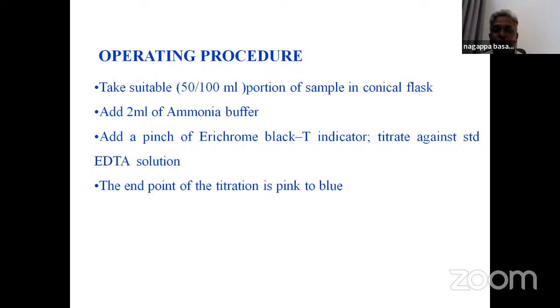Calcium and magnesium we can also measure by using AAS or other methods, but it is expensive. A good simple method, less cost, very good accuracy, we are getting by using this EDTA method. You can use it.